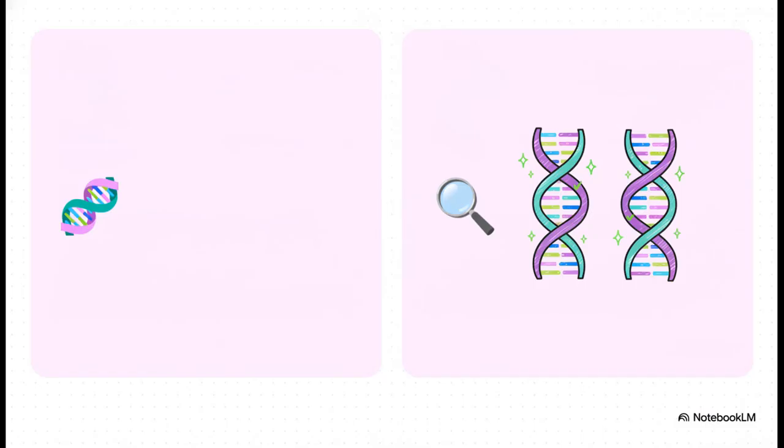Before we can even think about taping our shredded manual back together, we have to store all these short genetic sequences in massive text files. In the data science world, you're going to hear about 2 main file types, FASTA and FASTQ. It's actually pretty simple. FASTA is just the raw text of the shredded book, a massive string of letters. But FASTQ is that exact same text plus a built-in confidence score for every single letter.